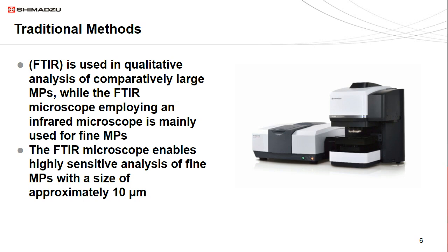However, there are certain cases where it is difficult to distinguish the microplastics that contain multiple types of these fine plastic particles. In this case, we can see where pyrolysis gas chromatography mass spectrometry, or PY-GCMS, can be a very effective method for microplastic characterization and identification.